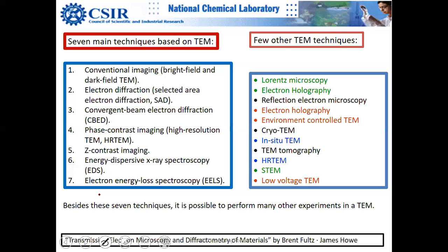Another very interesting interaction is the creation of plasmons. Plasmons are actually the oscillation of electrons around the nucleus.